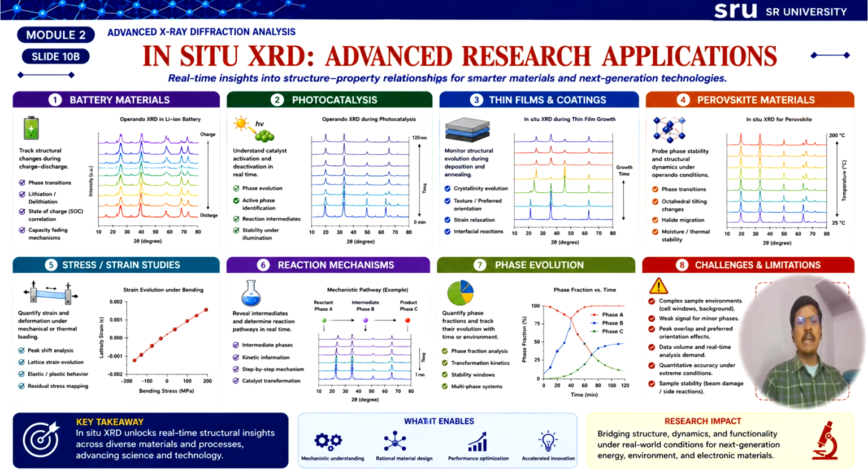But they create a lot of disturbance to the structure. In situ XRD captures these intermediate phases and helps researchers understand the reaction pathway and kinetics.